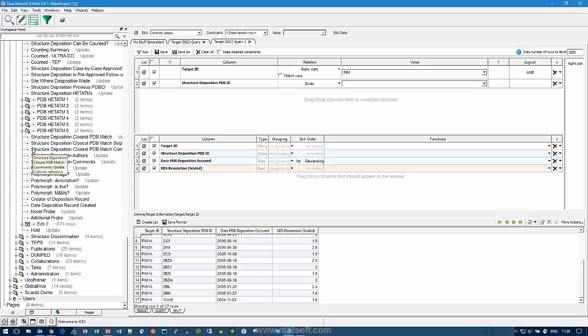Okay. We had another question. When you open in Excel, are you able to point to a different data program such as a free spreadsheet software, maybe Google Docs or something like that? Yeah, that's a good question. Right now, you can right-click. You can export to a CSV file.